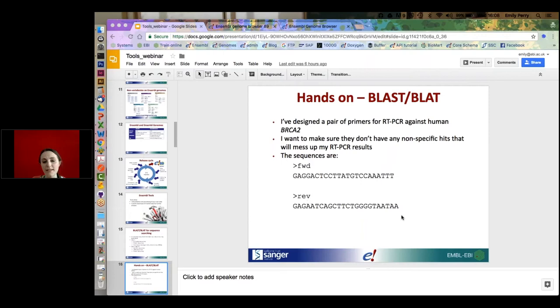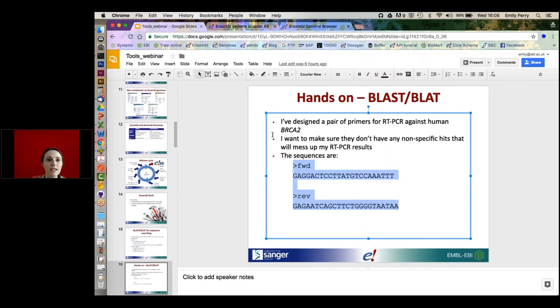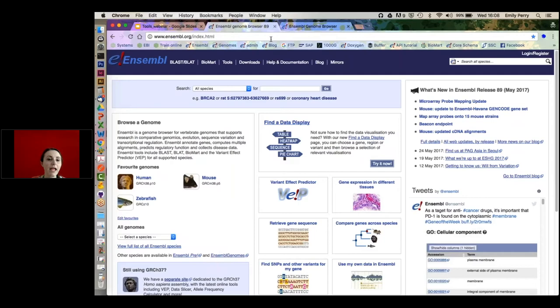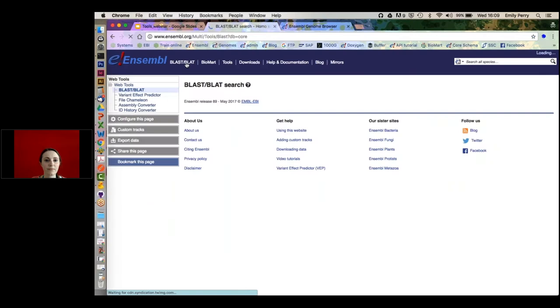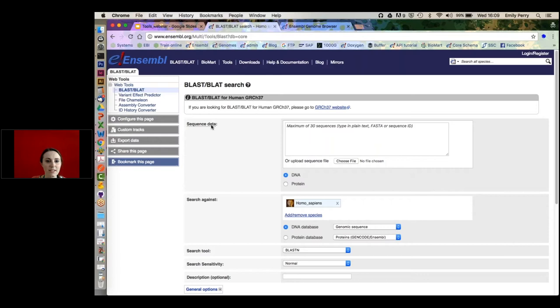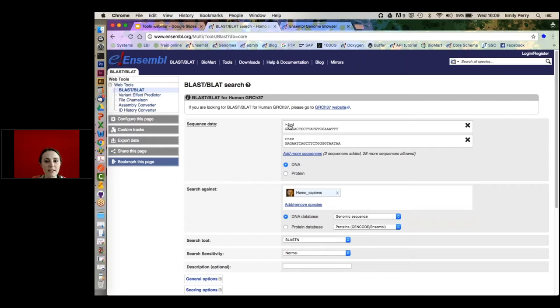I can put anything as my sequence titles as long as I put a little arrow on them. I'm going to select this and copy it, go into the Ensembl genome browser at ensembl.org, and go into BLAST/BLAT at the top. This is the BLAST interface — I've got a box where I can paste in my sequences or choose a file. It automatically detected two sequences and it can go up to 30 sequences.